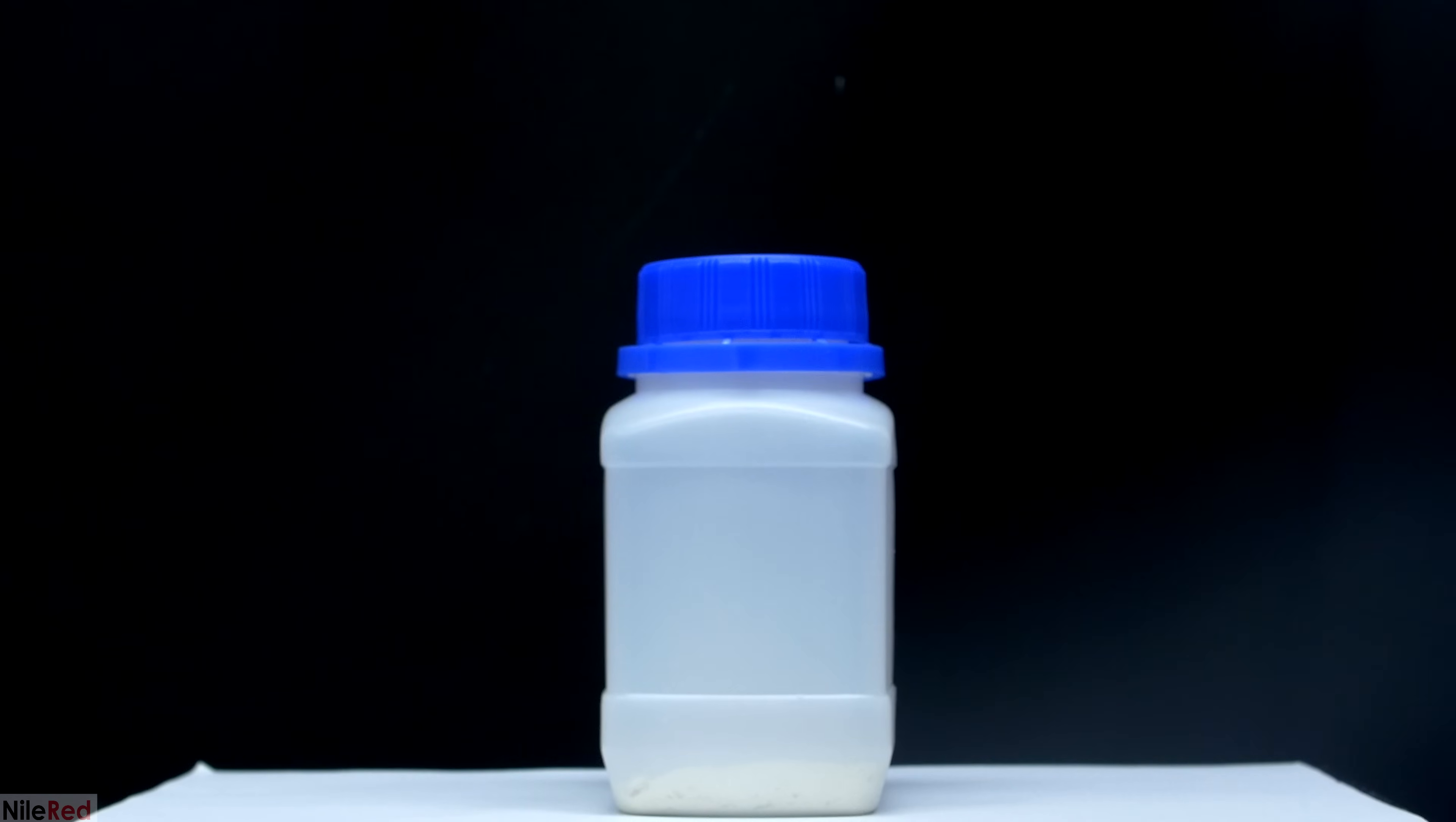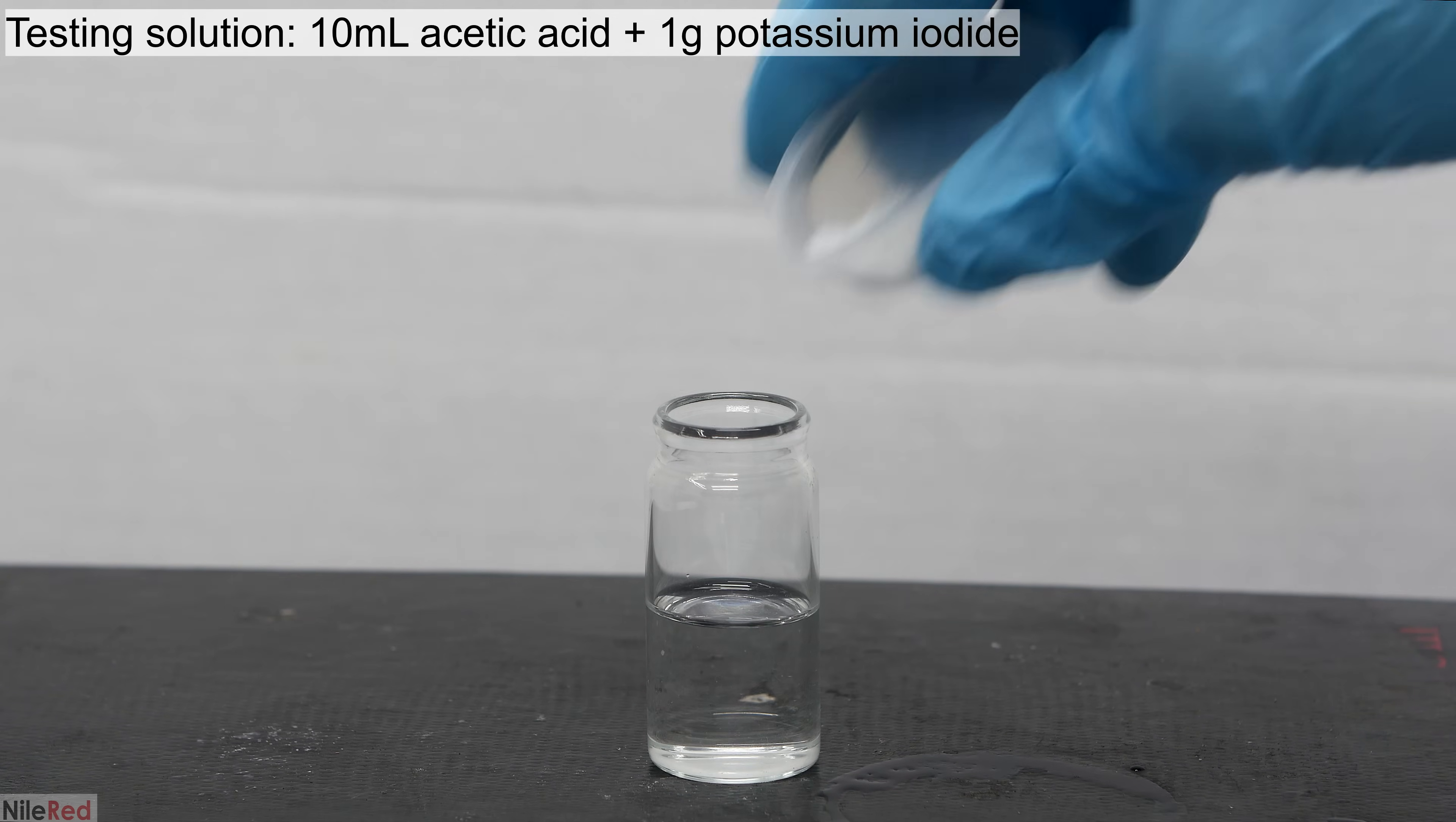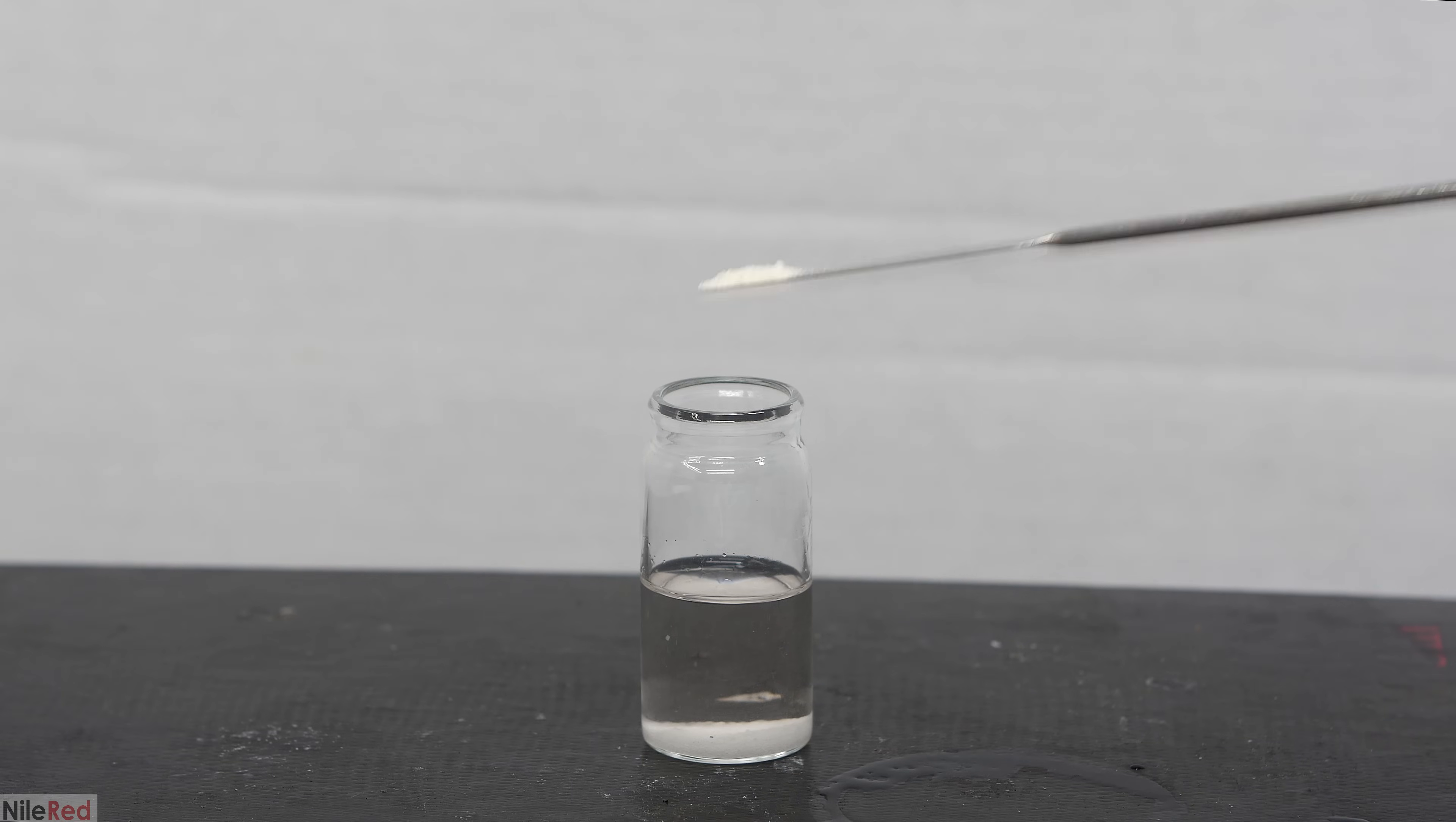Before proceeding on to doing any experiments, the first thing that I'm going to do is make sure that we actually have lithium peroxide. In order to do this, I'm going to carry out a very simple peroxide test. To carry out the test, we need to first prepare the test solution, which involves mixing about one gram of potassium iodide and about 10 milliliters of glacial acetic acid. I use a glass stir rod to mix things up, but most of the potassium iodide is going to remain undissolved. We're done making our test solution now, and all we need to do is add a little bit of our alleged lithium peroxide.